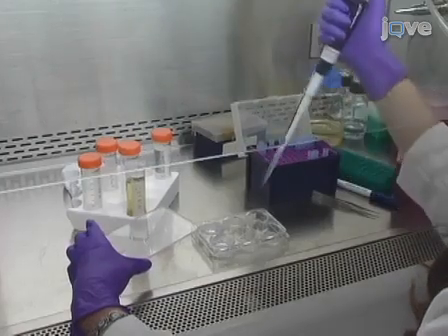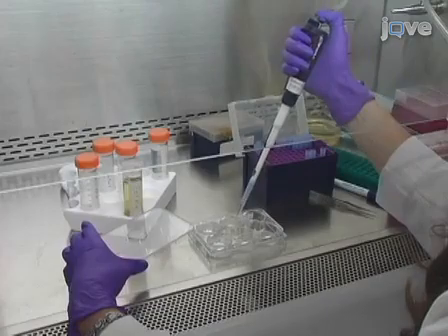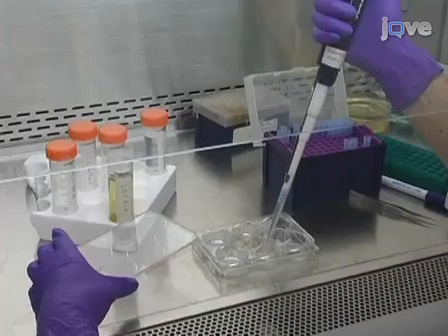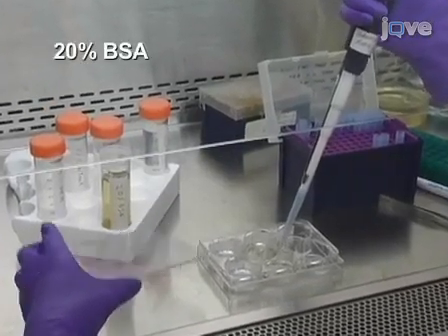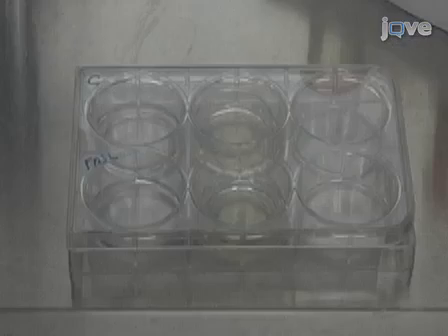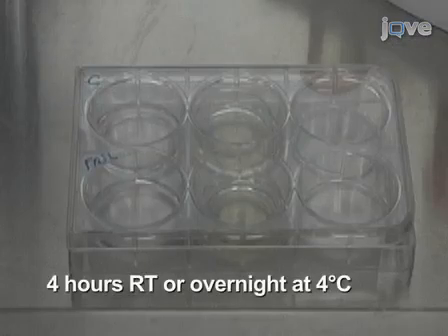Following permeabilization, aspirate the 0.5% Triton X100 in PBS and pipette 1 ml of 20% BSA in PBS on top of the slice and 1 ml beneath the slice. Block the slices for a minimum of 4 hours at room temperature or overnight at 4 degrees Celsius.